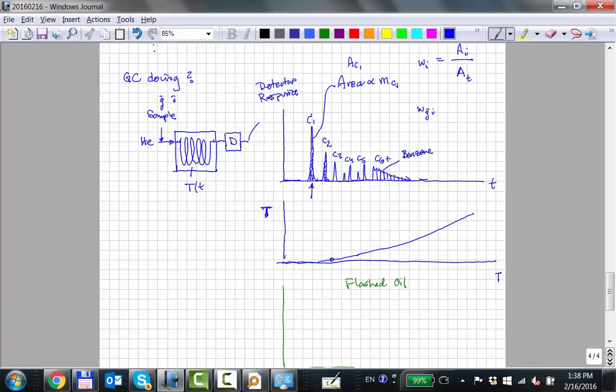There is a definite total area for this curve, not indefinite. Right? Not for gas. I think if you go to high enough temperature, what may happen is that this thing will actually start growing like this.